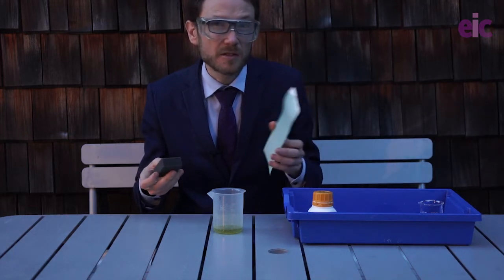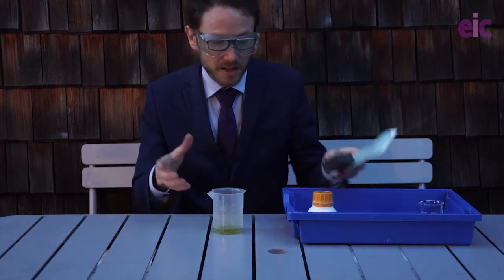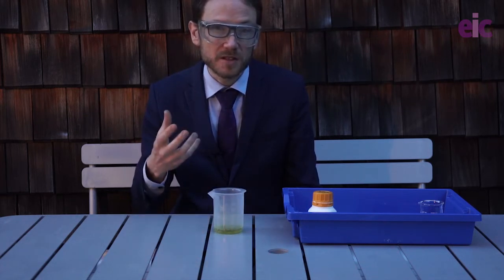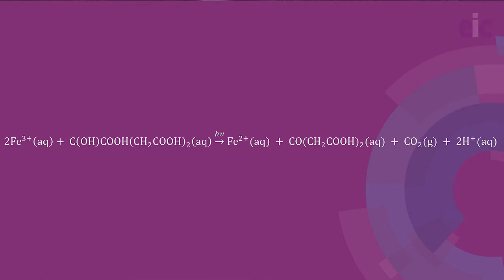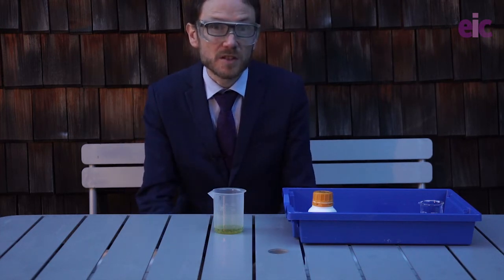In dim conditions this stuff is going to be pretty stable — it'll hang around for a decent length of time in the dark, but obviously you want to be keeping it away from direct sunlight until you're ready to actually do the experiment. So now that we've got an idea about what's going on here, let's go and see if we can develop the print. All I'm going to need to do is rinse off the unreacted citrate and iron(III) chloride, because what takes place is that in the presence of sunlight the iron(III) will be reduced whilst the citrate is oxidised, and then we get our mixed oxidation state complex — Prussian blue — which precipitates out as a solid, meaning the rest of the soluble materials can just be rinsed away in water, leaving us with a nice blue permanent print of whatever image we were taking.